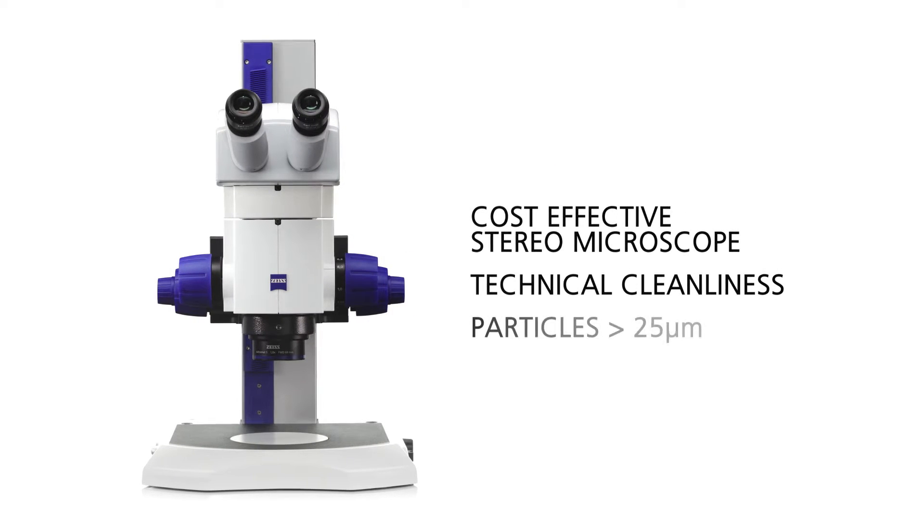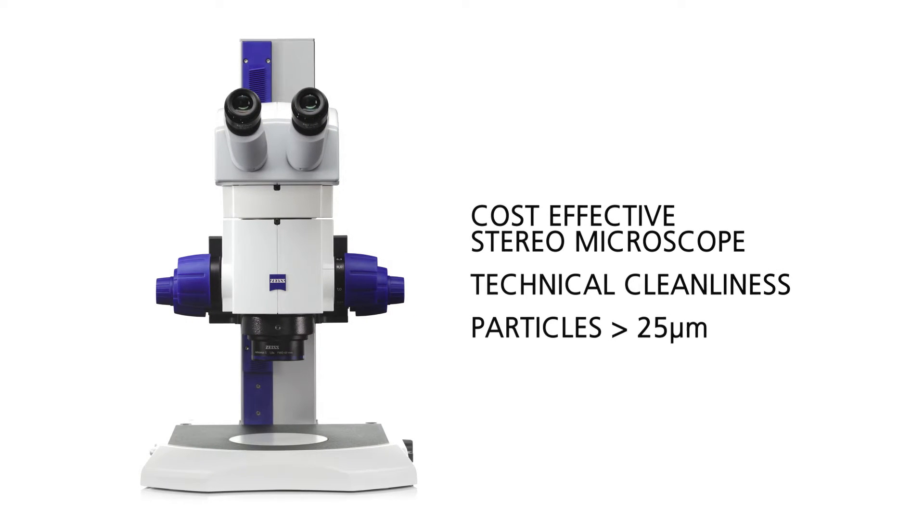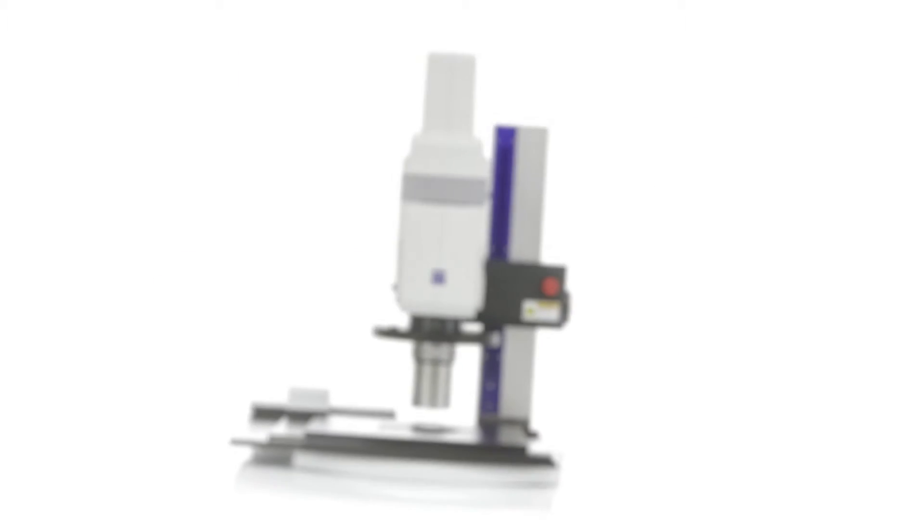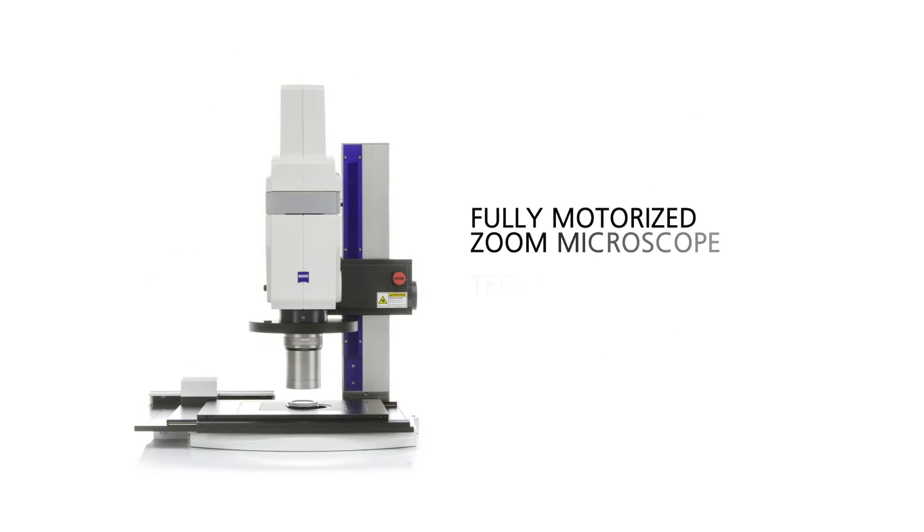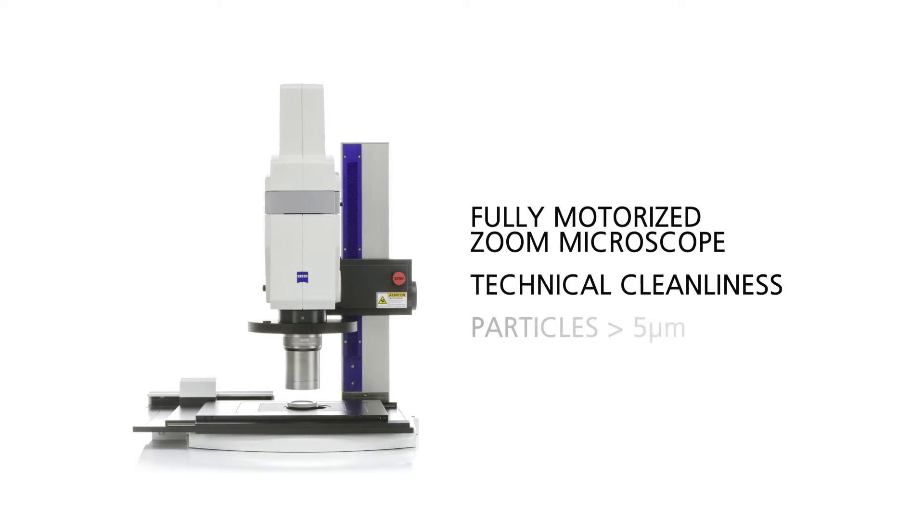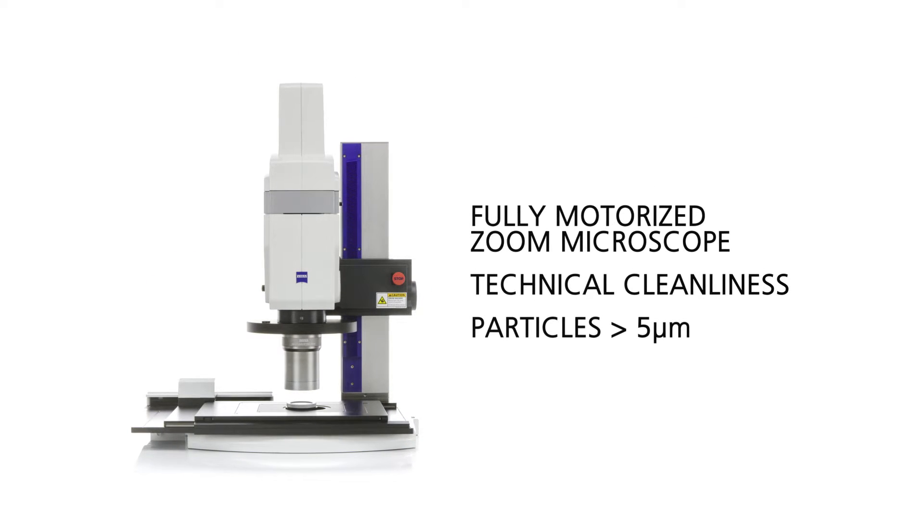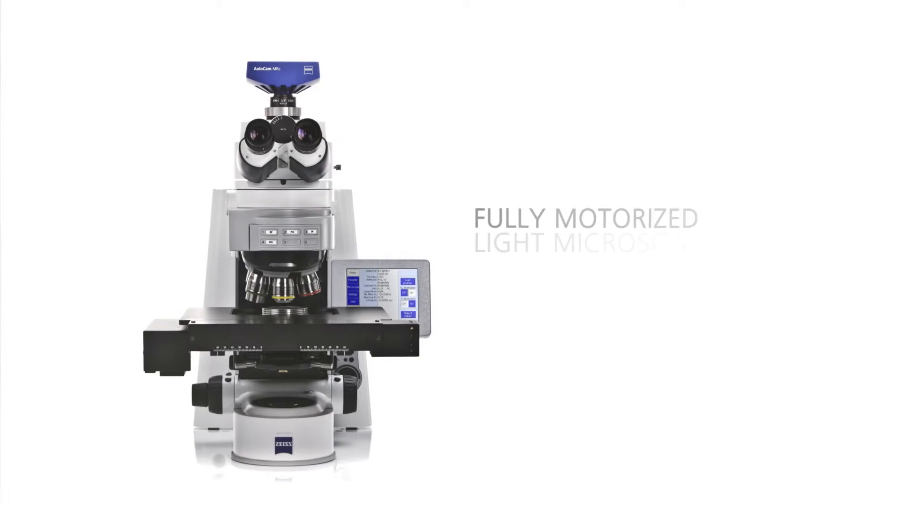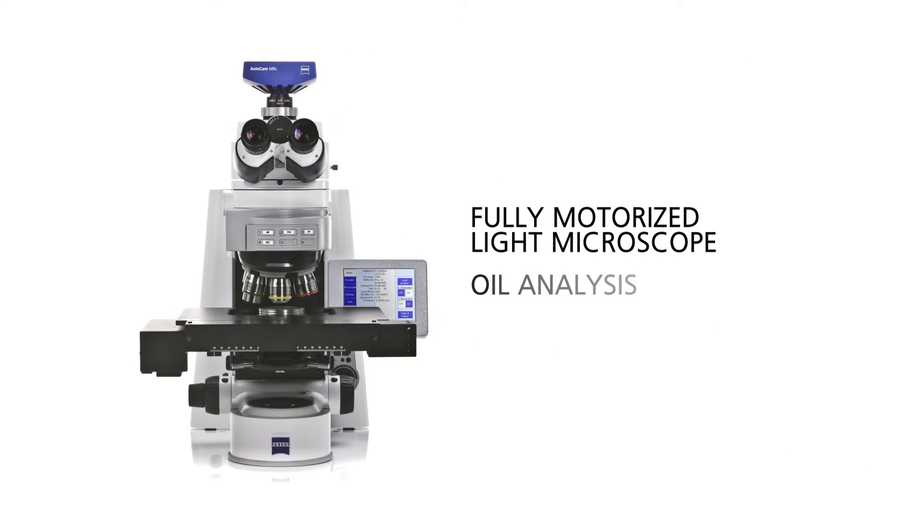Do you want to analyze parts for residual particles on your filter? And in the process, gain comprehensive information about your metallic, non-metallic, inorganic and organic particles?